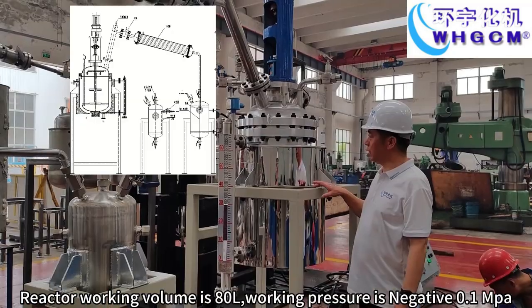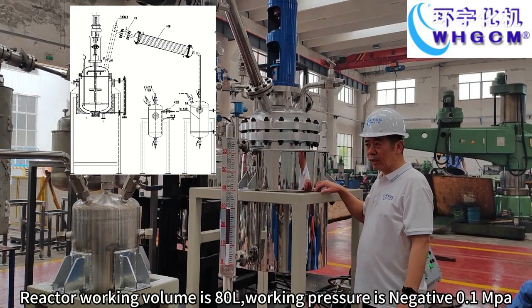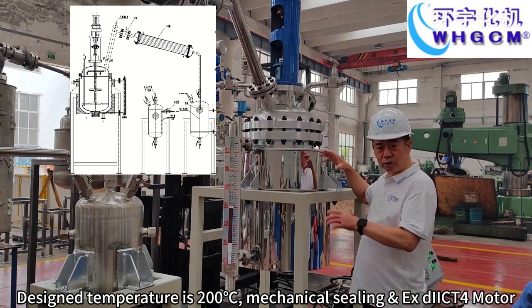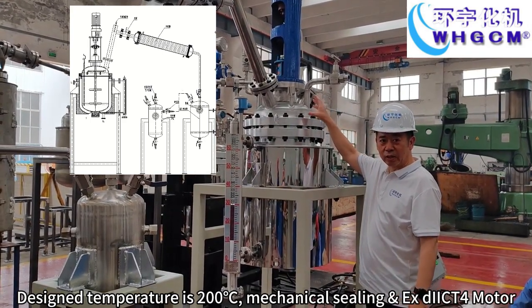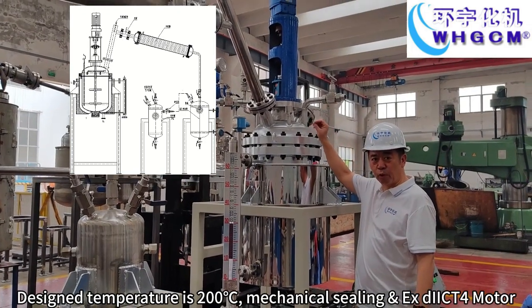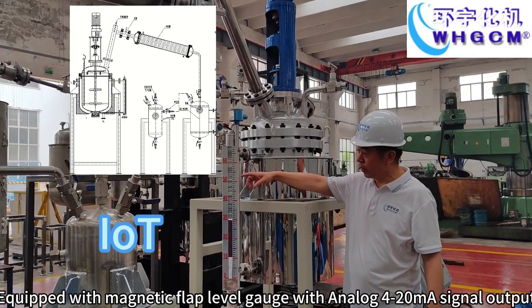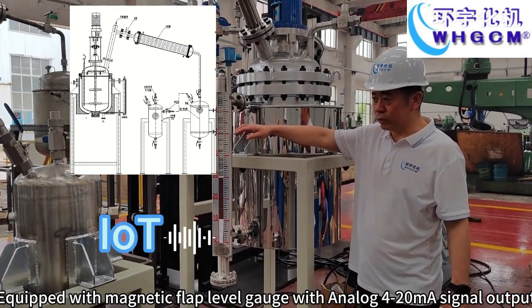Reactor working volume is 80 liters, working pressure is negative 0.1 MPa. Design temperature is 200 degrees with mechanical sealing and explosion-proof motor. Equipped with magnetic flap level gauge with analog output 4 to 20 mA signal output.